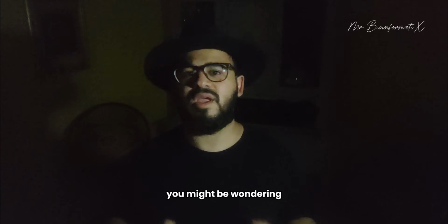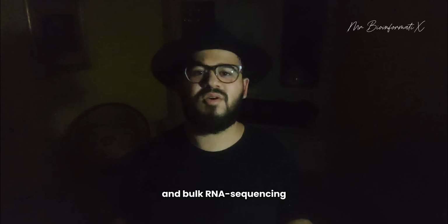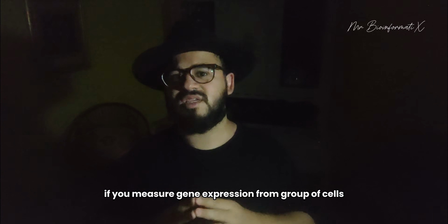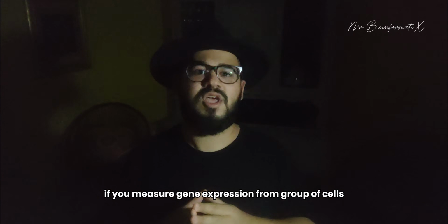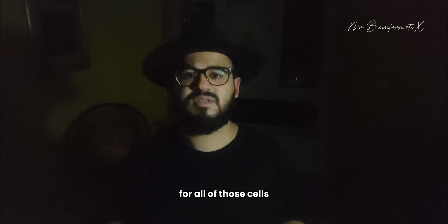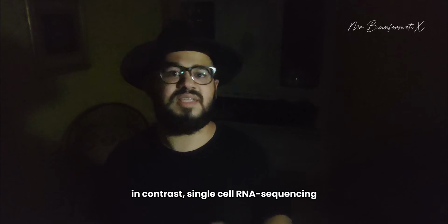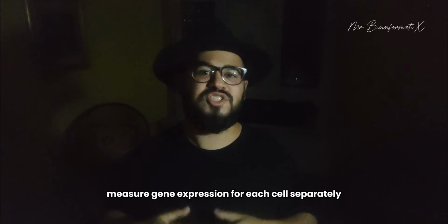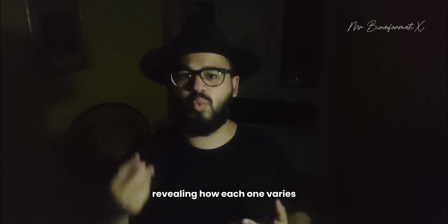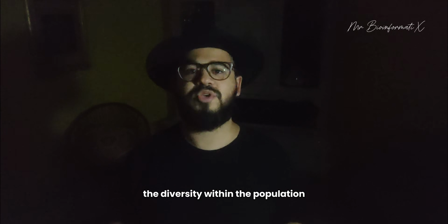You might be wondering, what are the differences between single-cell RNA sequencing and bulk RNA sequencing? With bulk RNA sequencing, if you measure gene expression from a group of cells, you get just one average value per gene for all of those cells, missing out on individual differences. In contrast, single-cell RNA sequencing measures gene expression for each cell separately, revealing how each one varies, and allowing us to study the diversity within the population.